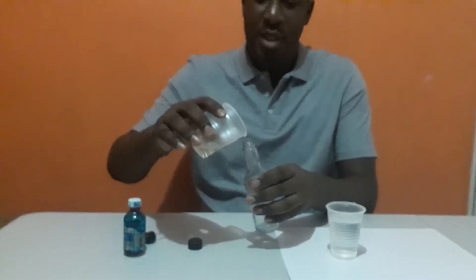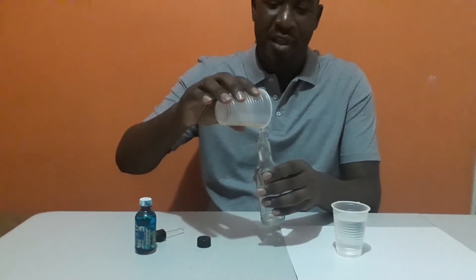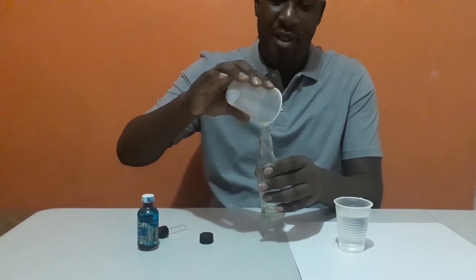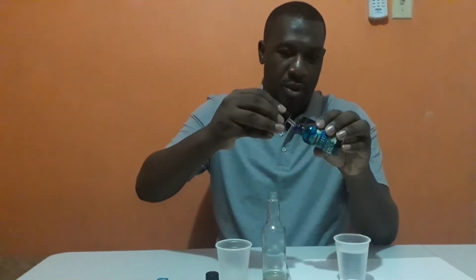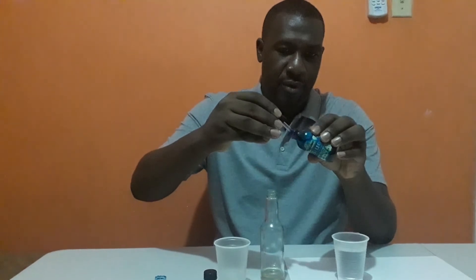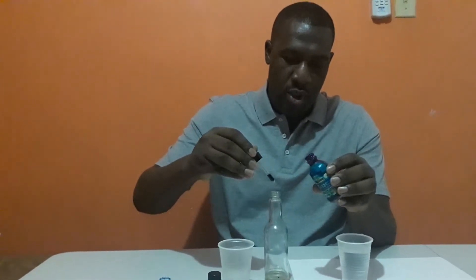I'm going to go ahead and pour my oil into my makeshift separatory funnel. And there I have my oil. I'm going to go ahead and use this dropper to add a little bit — one drop.